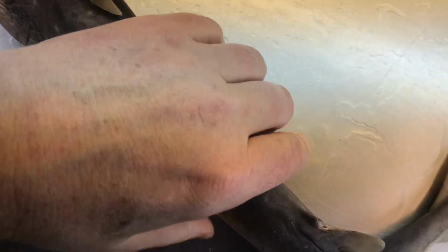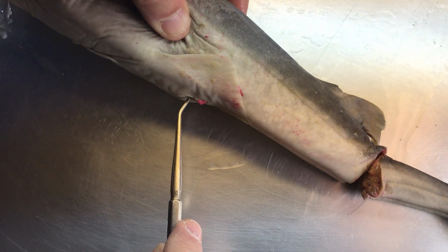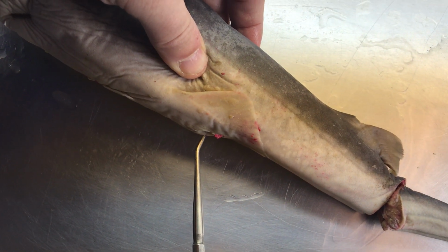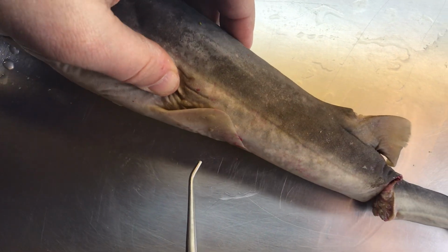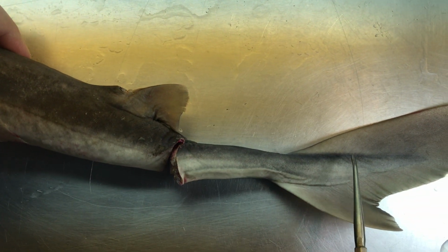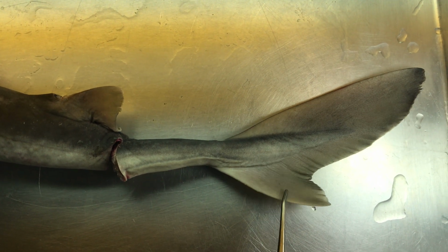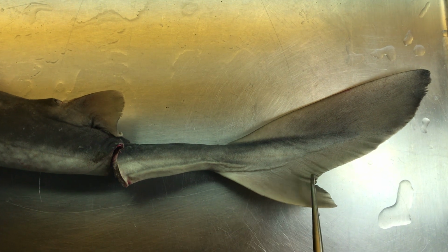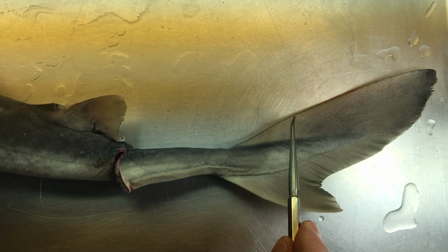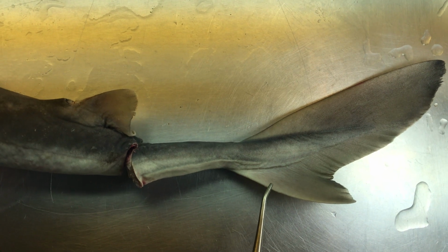For the tail, the tail is the body that is beyond the cloaca here. Again, the cloaca is a chamber in which 2 or more body systems empty, and which includes the digestive system as well as the excretory system. So the caudal peduncle is all the muscle tissue of the tail. And then we have the caudal fin. On sharks, the caudal fin is heterocercal, which means the dorsal lobe is differently shaped than the ventral lobe. Most of the bony fishes have a homocercal fin, in which both the dorsal lobe and ventral lobe are about the same. So sharks have a heterocercal type fin.